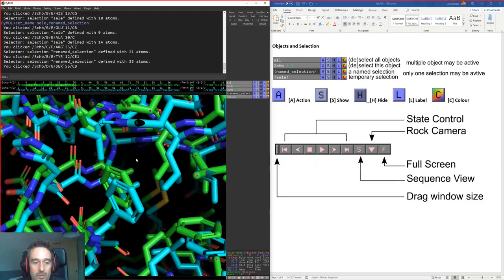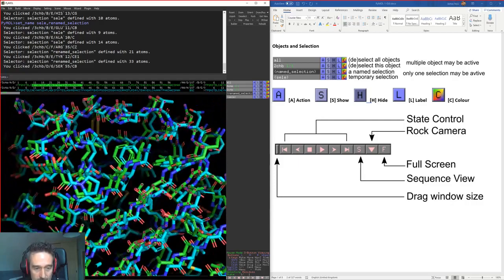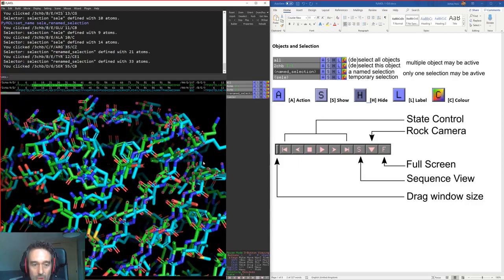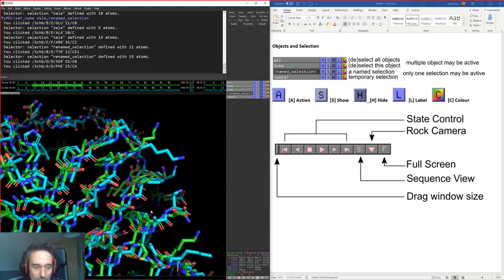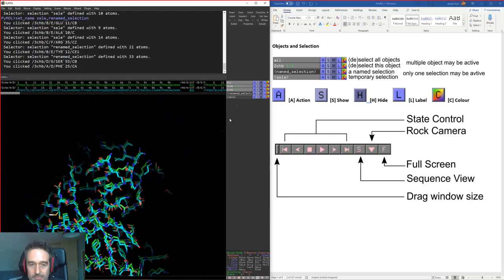2 seconds there, let's just make this selection here, and then there we are. So you can see that we've not very well oriented around that selection, but there we are. And again, if I change here to chains and I click up here, I select the whole chain, etc. But navigating using the sequence view is very useful as well.